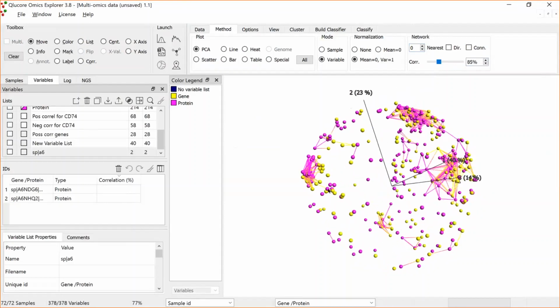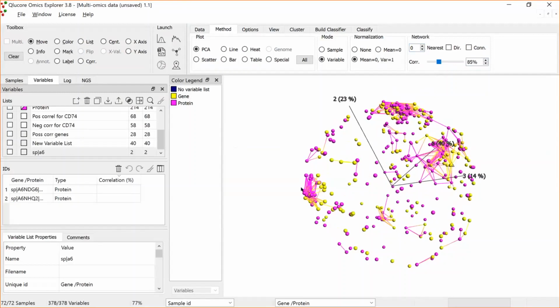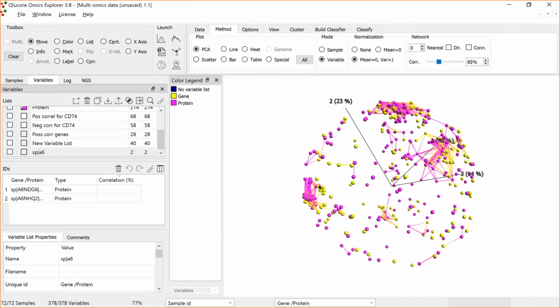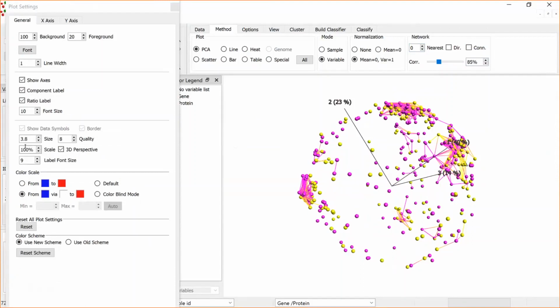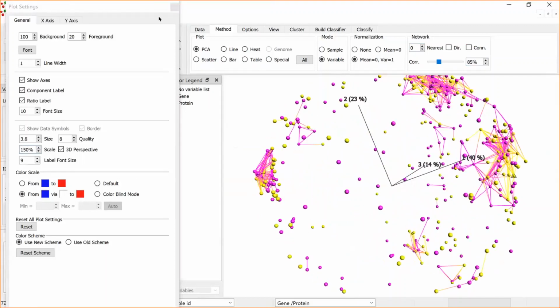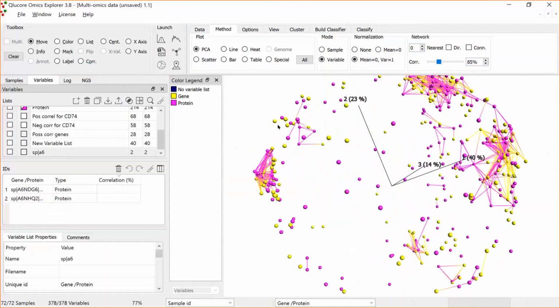And then we can try to grab this into a list again. It's a bit hard to see, so I will actually double click in the plot and zoom in a bit here. So it's a bit easier to see like that.